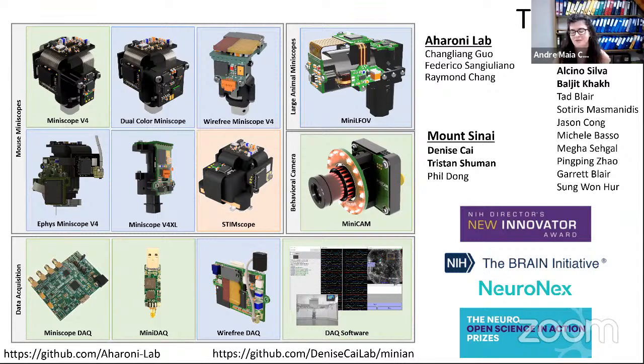So maybe just to touch on the last subject, these 5 more minutes, people were wondering about data analysis pipelines, whether you were working with or developing some data analysis software, that was Andre. Then Amol was asking whether the Miniscope data can be exported and analyzed in commercially available software. And Mikkel was wondering about how Miniscope and Minicam interact with Bonsai, but I think someone in the chat already pointed them to the wiki link.